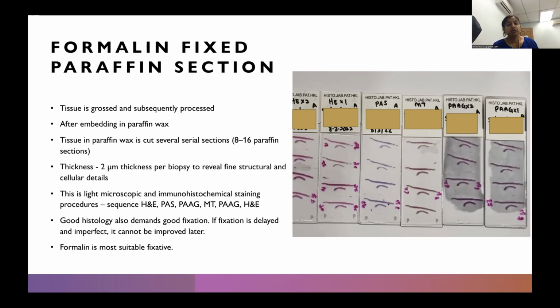I suppose it is good, because let's say if you see a granuloma in level 2, and obviously after you have already done a few levels, you would want to do a ZN stain on it. And if you don't have a subsequent unstained level, you can't do it, because probably in level 7 or 8, that granuloma doesn't exist anymore. So this is beneficial for them. That's the way certain centers do it. But for us, this is how we're doing it.